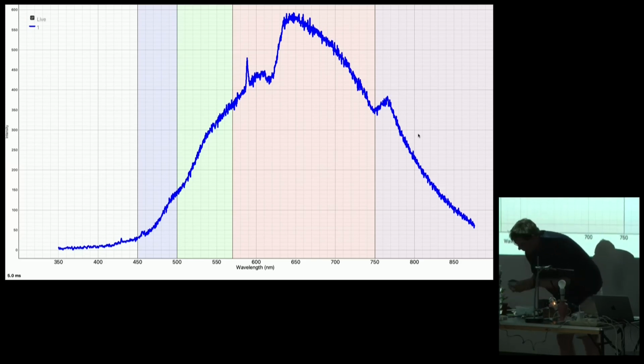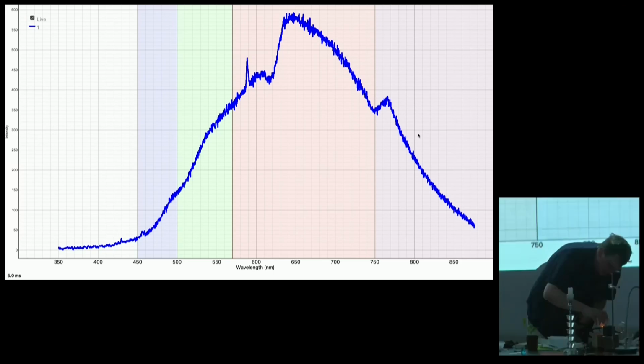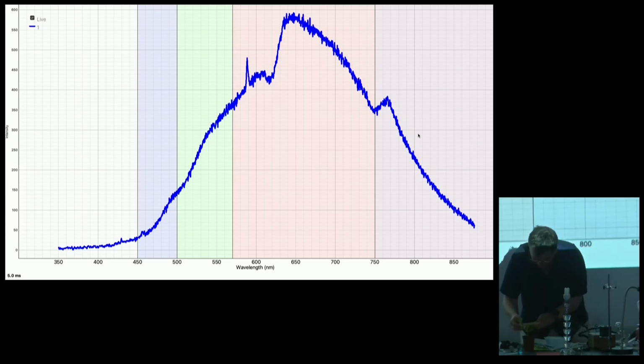Right. I don't know where my teaspoon has gone, but never mind, let's just pour it on here. So I've got a mystery substance here that I'm going to put here. Whoop, oh, now I've blown it out again. Apologies, never do live demos.